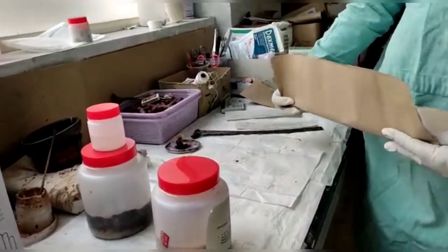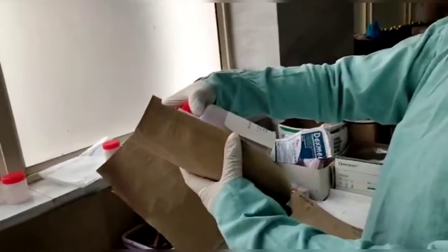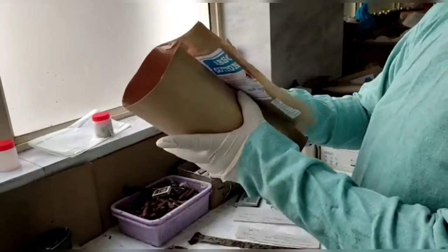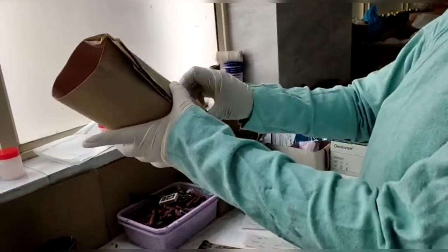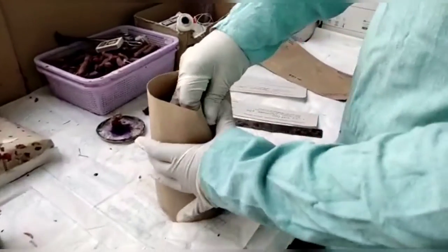Next, you can see that the person is packing the Viscera with paper. For packing the Viscera, they usually use a brown paper or maybe a white paper.